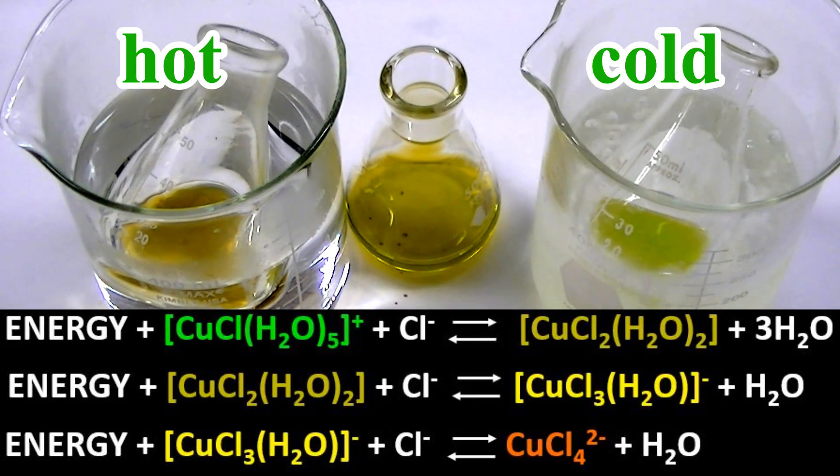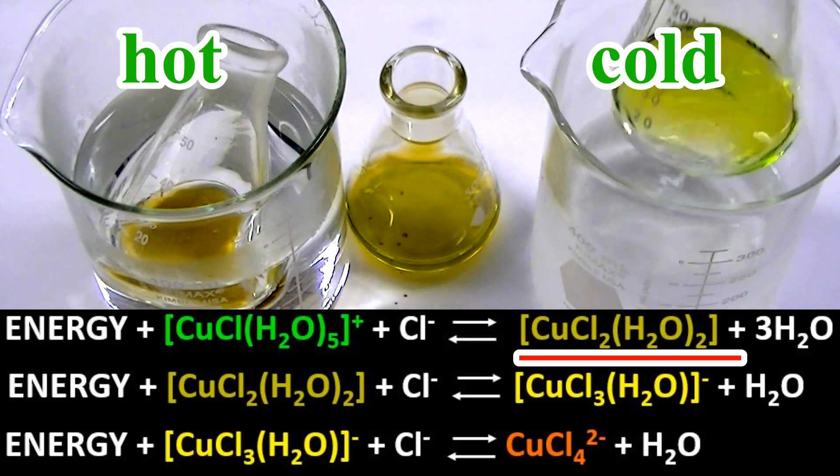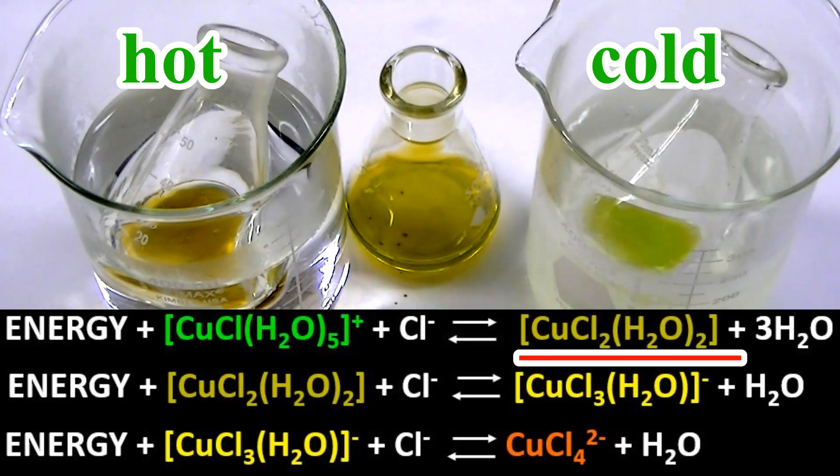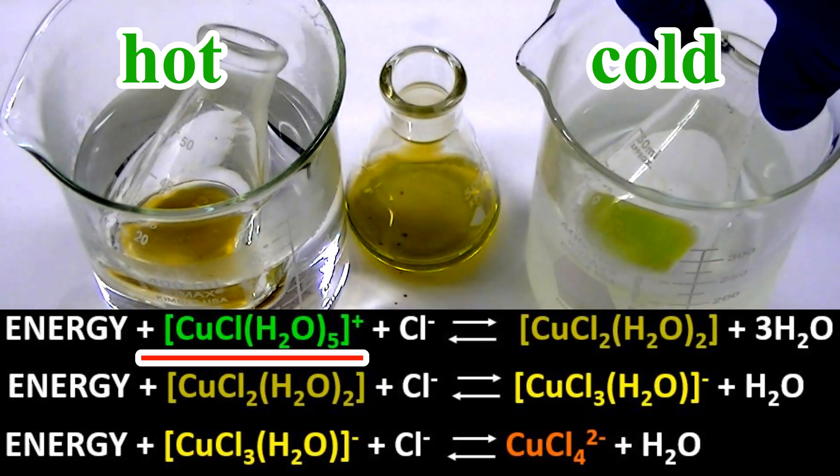Endothermic reactions tend in the reverse direction toward reactants at lower temperatures. Thus, the dichloro-copper complex is converted to the green monochloro-complex in the chilly dry ice acetone mixture.